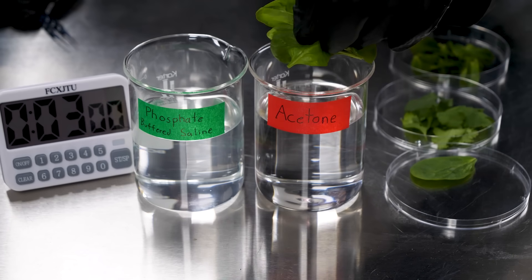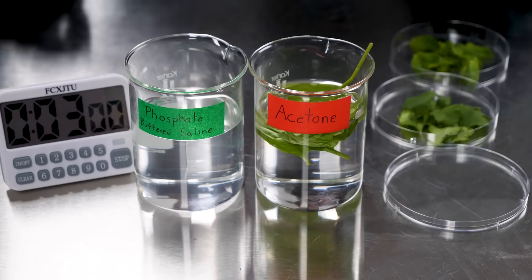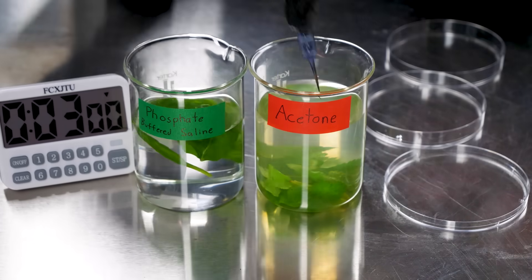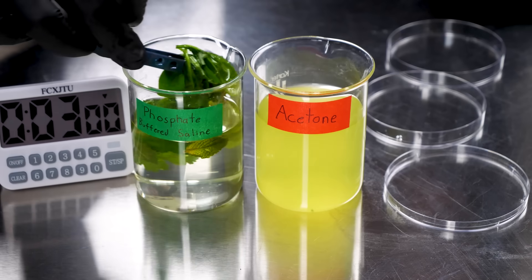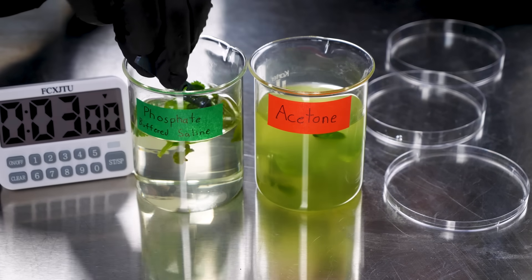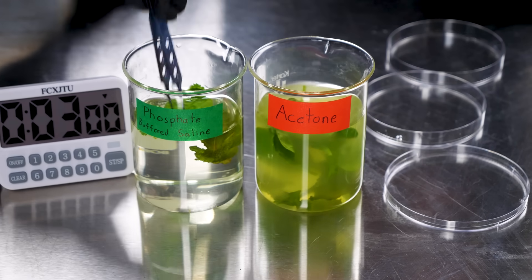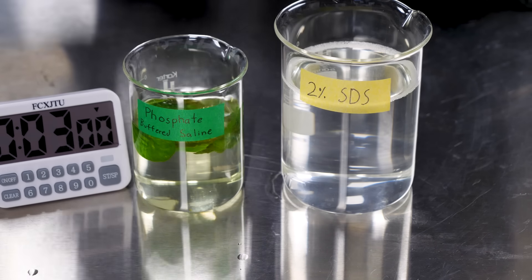Now we need to remove the waxy cuticle that coats the outside of the leaf. To do that, the paper we're following suggested dunking the leaves alternately back and forth between a non-polar solvent, here we chose acetone, and a solution of phosphate buffered saline. Honestly, I think this probably caused more damage than just letting the leaves soak in the solvent longer, but we did three cycles of carefully fishing out the delicate leaves and transferring them back and forth between the beakers, letting them sit for a minute between cycles. After that, we're onto our first soap washing.